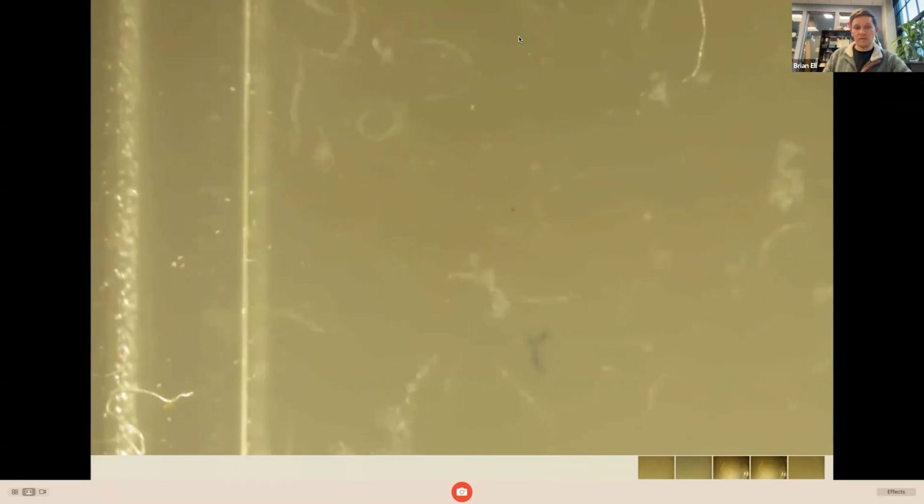One thing to take note of, depending on the microscopes you're using: some microscopes have a light directly underneath the platform that this counting chamber slide is going to be sitting on. Sometimes those can heat up pretty rapidly. I would check that on your microscopes. Ones with incandescent bulbs, mercury bulbs, or halogen bulbs can give off a lot of heat, and that is not great for our worms.